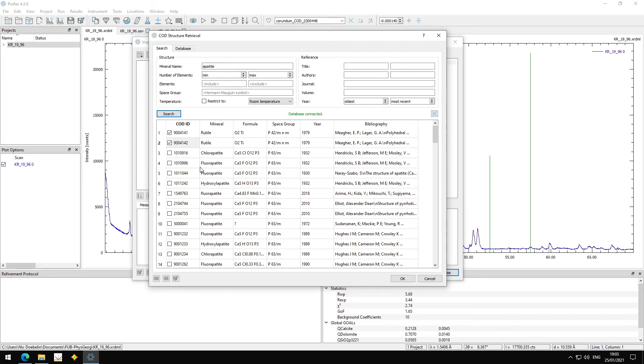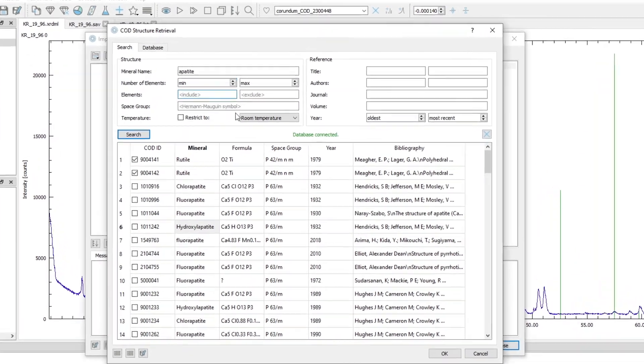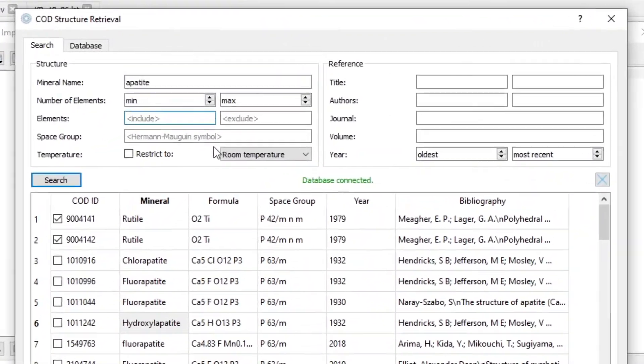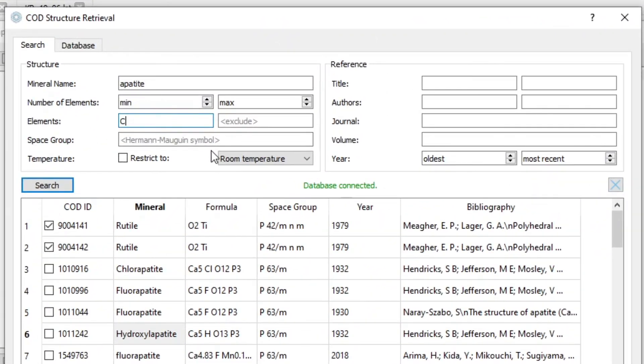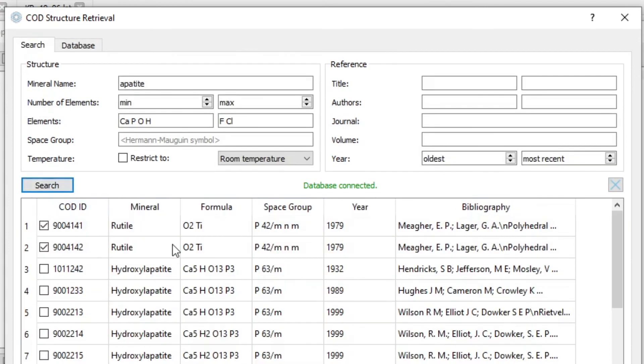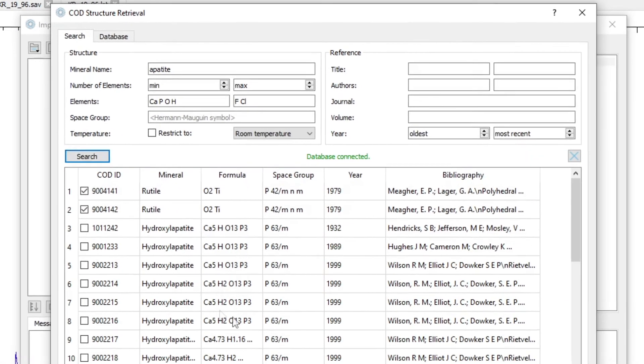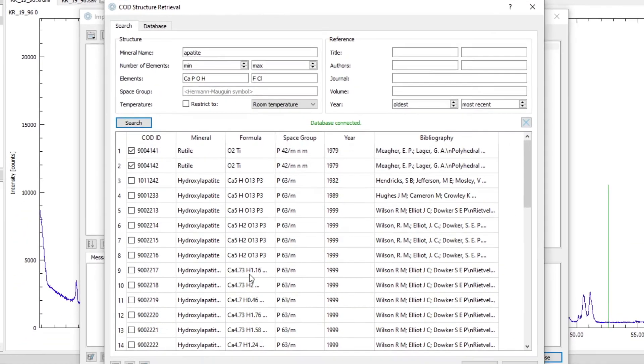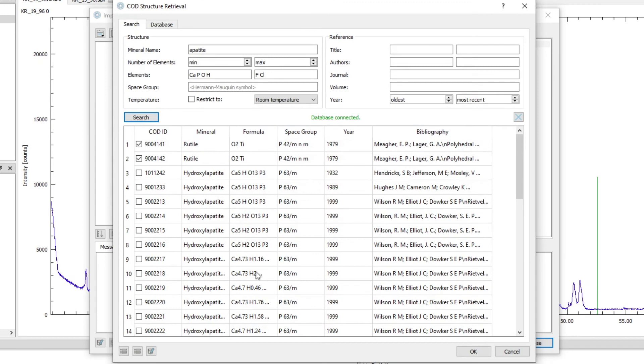Now, appetites. There is a lot of different ones: chlor appetite, fluor appetite, hydroxy appetite. Let's filter only hydroxy appetites. So I want calcium, phosphorus, oxygen, and hydrogen. And I want to exclude fluorine and chlorine. Now I have only the hydroxy appetites.